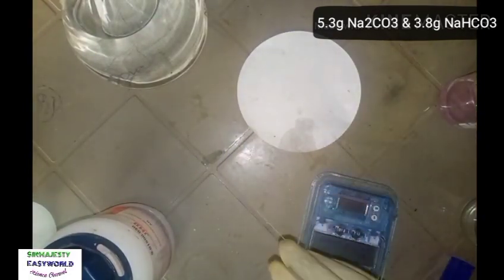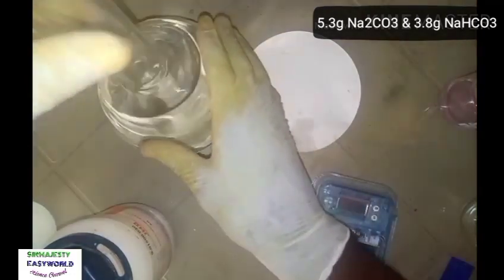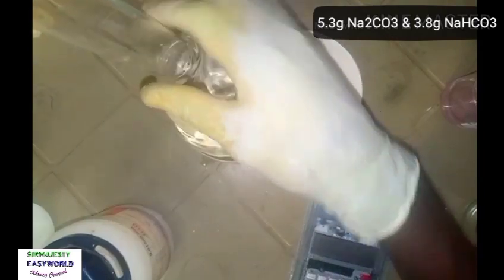You keep them separately. What you do now is bring your volumetric flask. This volumetric flask is a 1000. There is a mark over here. The mark is for 1000 ml. I don't know if my camera can get it. I guess so. So what you do first, this is the solution I've already prepared.